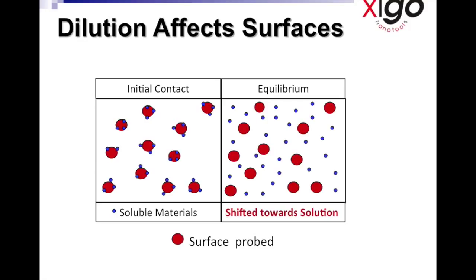So that's the important thing to take away from this, is that dilution is not an innocuous process. It doesn't mean you cannot dilute. There are ways around this to get it diluted, but if you simply dilute the material in a liquid, you're going to affect that particle-liquid interface, which is now going to affect the wettability of that surface and anything else you're going to do with it. So measuring samples in the dilute regime does not necessarily translate always to what you would get in the concentrates, and it is always better in any situation to measure the sample as it's made, not as it has been changed, in order for you to get a measurement with a particular type of instrument.